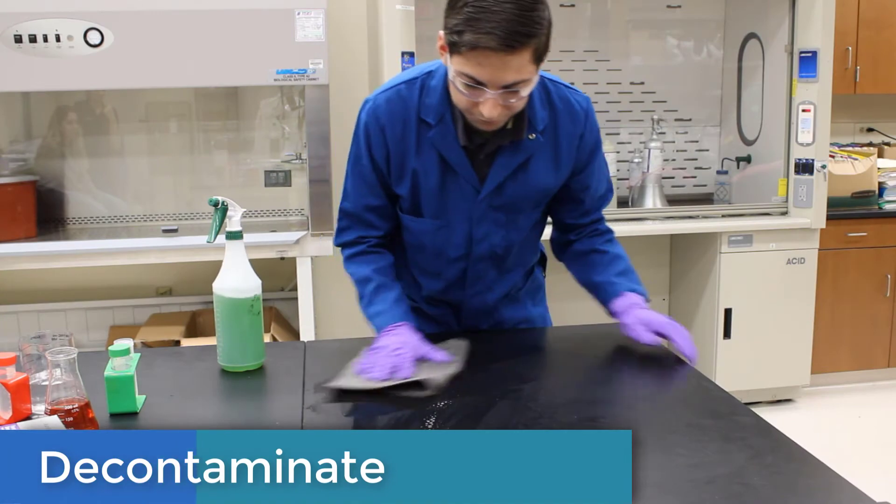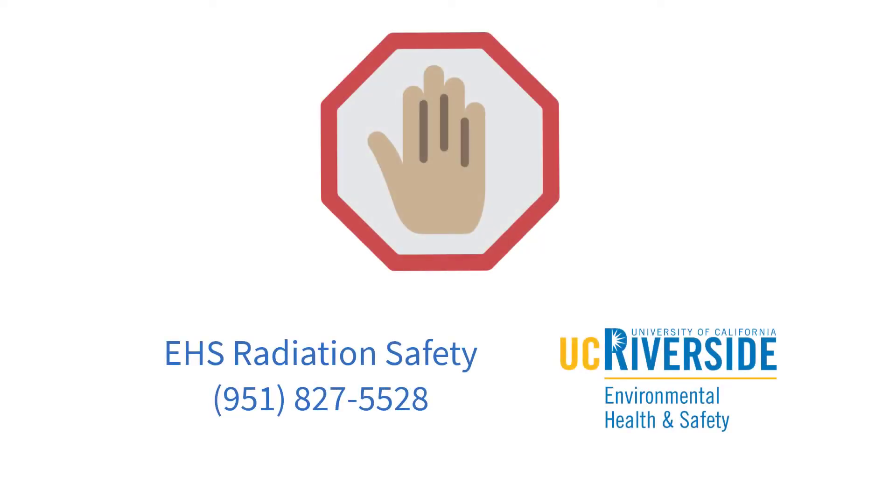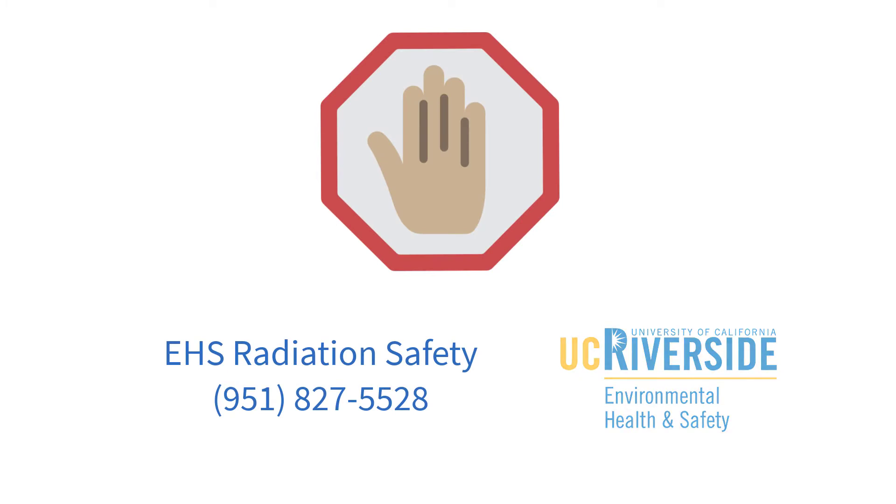When all is cleaned up, properly decontaminate using appropriate cleaning solutions or disinfectants according to the SOP. Chemical spills involving radioisotopes should be decontaminated accordingly — stop and contact EH&S Radiation for assistance.